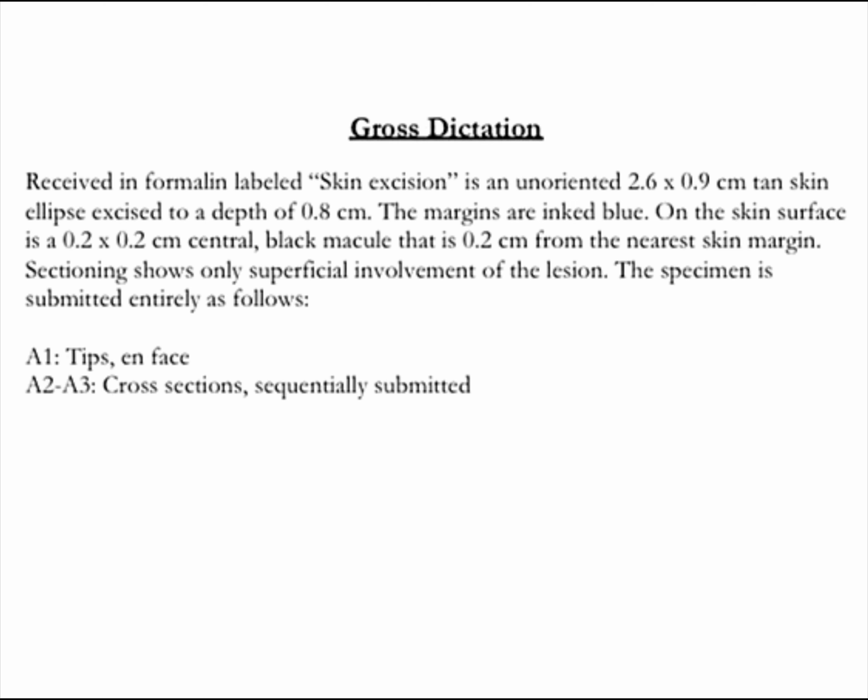On the skin surface is a 0.2 by 0.2 centimeter central black macule that is 0.2 centimeters from the nearest skin margin. Sectioning shows only superficial involvement of the lesion. The specimen is submitted entirely as follows. A1 tips en face, A2 to A3 cross sections sequentially submitted.